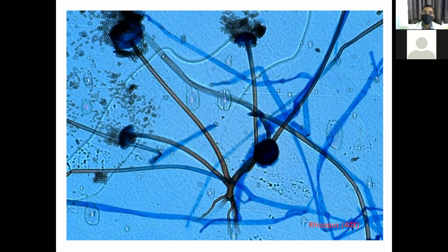This slide is a Rhizopus slide. Rhizoids are beneath the surface. These are microscopical examinations. After putting up one slide culture technique, the whole intact structure can be clearly visible. If you go directly to lactophenol cotton blue, there will be some disturbance with teasing needles and separation, and you will lose the intact structure.